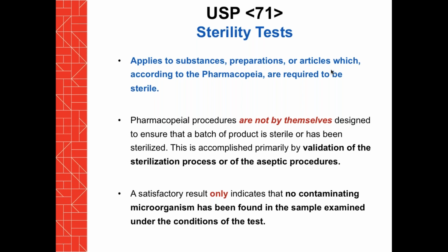A satisfactory test result only indicates that no contaminating microorganism has been found in the sample examined under the conditions of the test. I wanted to reiterate: look at how the tests are conducted and understand the purpose. It is critical to validate the sterilization process or the aseptic procedures and processes.